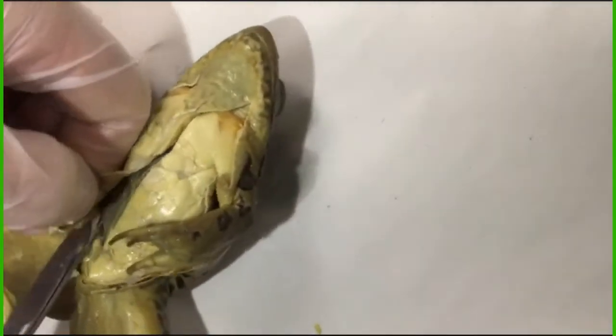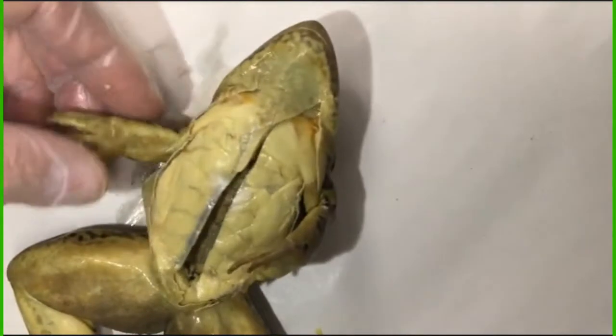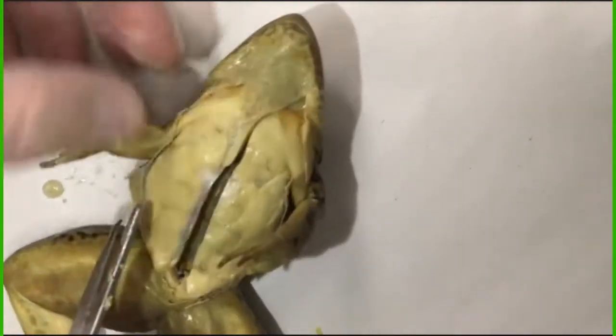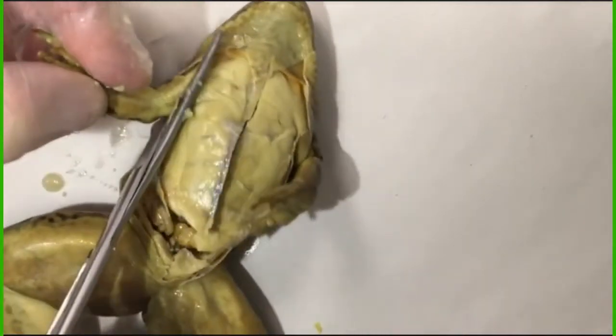Try not to waste any time with any kind of intricate cuts. We want to get maximum exposure of the organs in the body cavity, because the systems are the reason we do these dissections, and where we're going to see most of the systems that we've studied is right there in the chest cavity, and so that's why we do it.